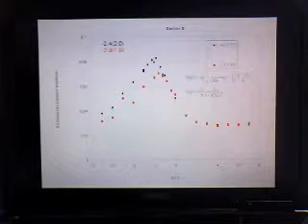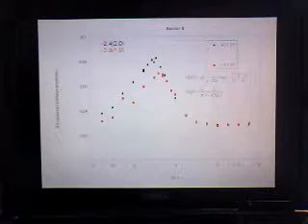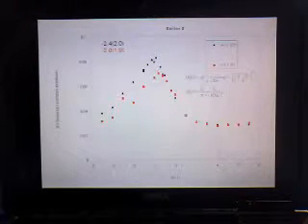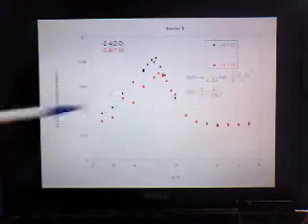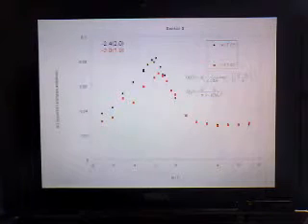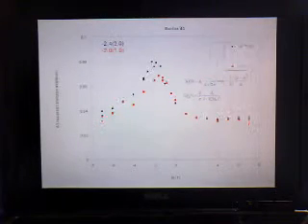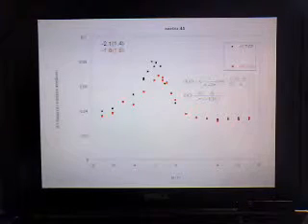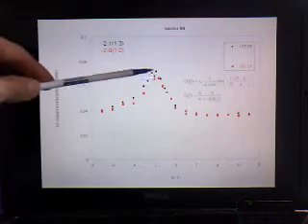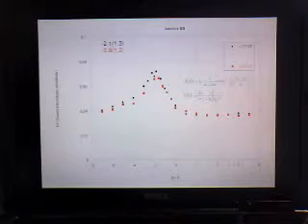information as coming from dysprosium iron 2 domains, or at least domains that are pinned that don't respond to field. Of course, there could also be substrate SANS, but that wouldn't change with sector. Well, I wouldn't think it should change with sector setting, but that's something we can think about. This is sector 45 for the amplitude of the squared Lorentzian, and sector 90. See, there's not very much difference here between the two cooling fields for this sector. This is true for the Gaussian function as well.